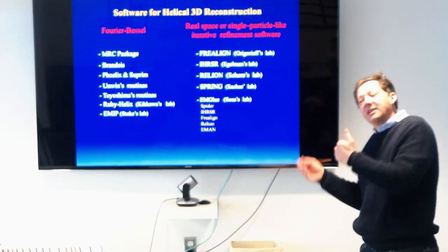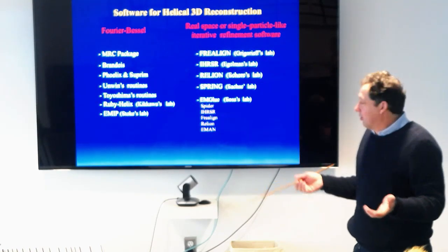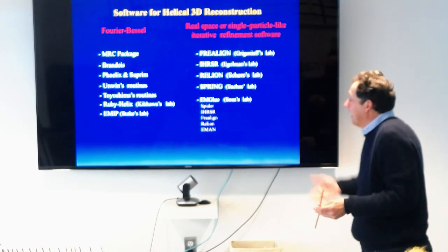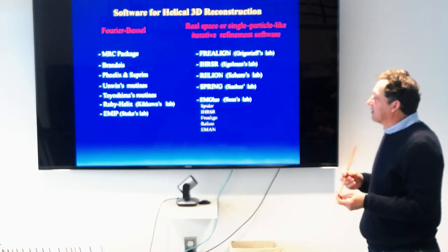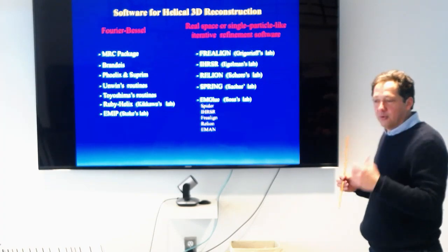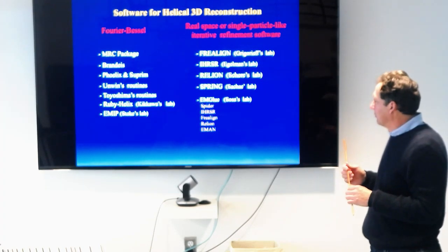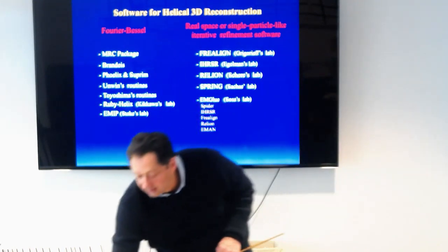Different software do it differently, and we do it in our own way too. Okay, and we have got some pretty good resolution. I think we attribute it to some tweaking that we have done for the microtubule filament that we have, and I will talk about what we actually do.